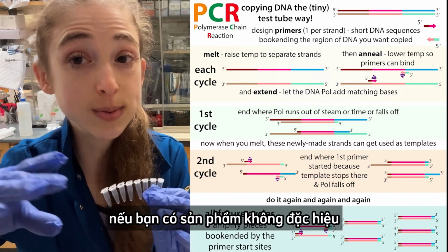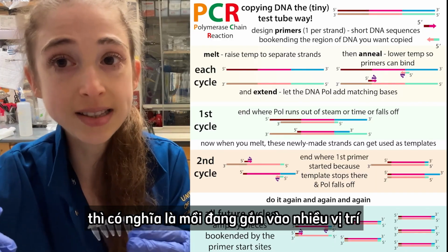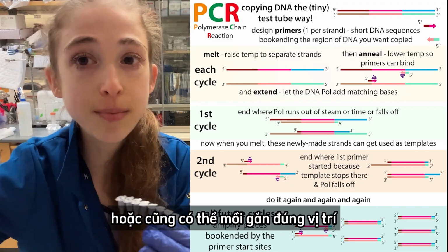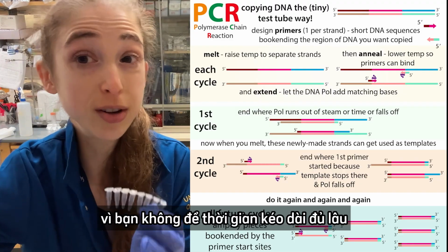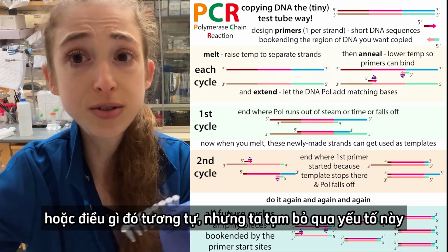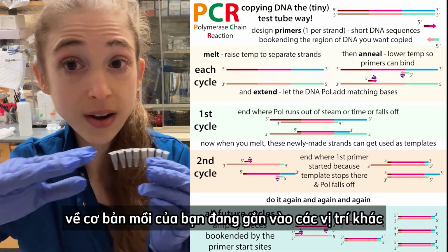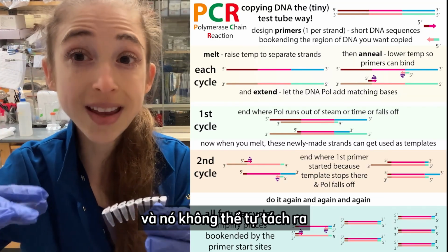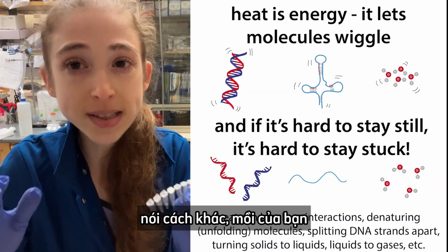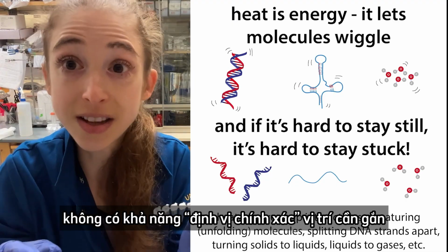If you're having non-specific products, what's happening is that the primer is finding multiple sites. Or it can also be that the primer is finding the right site, but it's not getting all the way through because you didn't put your extension time long enough or something like this. But we're just going to assume that right now, your primer is finding other sites to bind to, and it doesn't unbind from them. So basically your primer doesn't have homing-in skills on the site that you want.